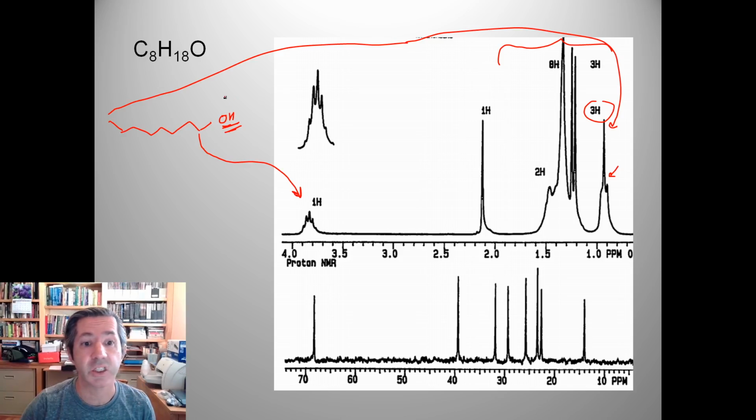This is what's called an exchangeable hydrogen. And because it undergoes intermolecular hydrogen bonding really well, it tends to not always be present on the molecule. And so usually it does not experience splitting. But sometimes it does. And they can be hard to nail down.